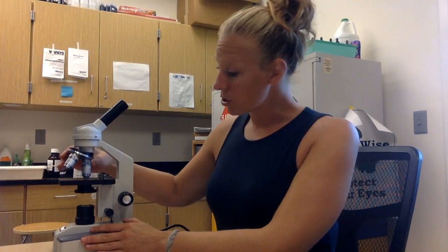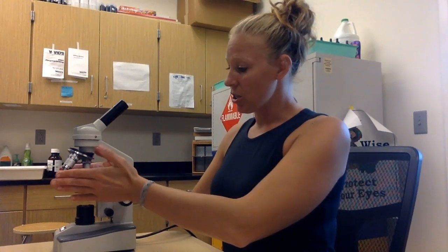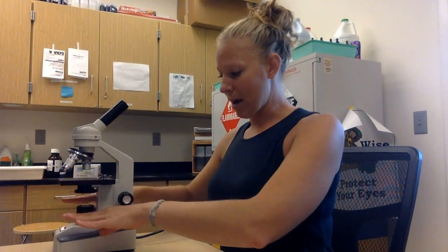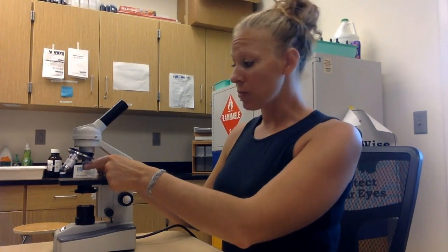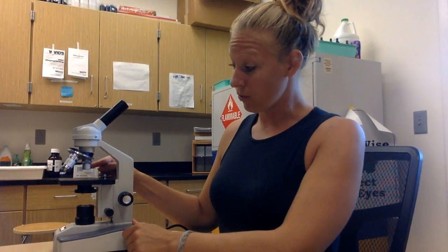Once we have it all set up, we are ready to start using our microscope. We always, always, always want to start with the stage all the way down — as far down as it can go — and always with the smallest magnification. That would be the 4x objective lens, giving us 40x total magnification.